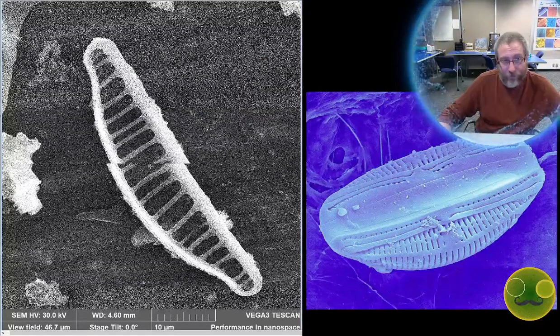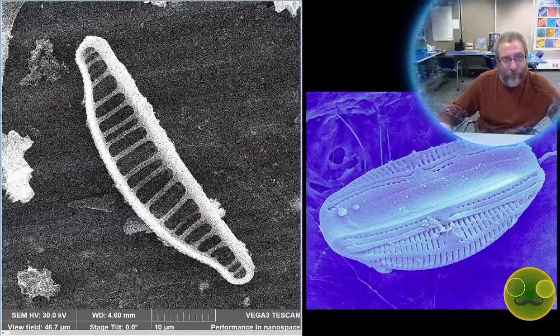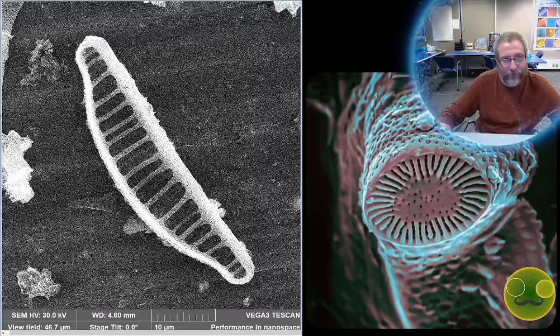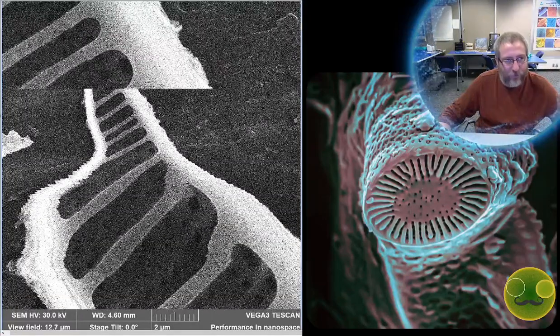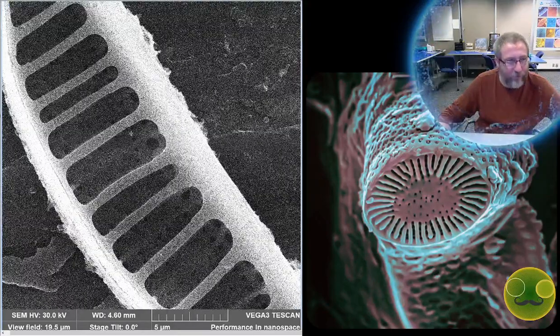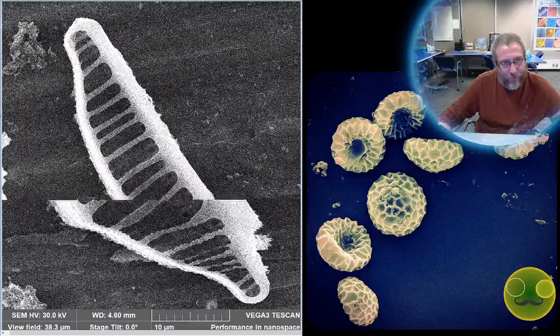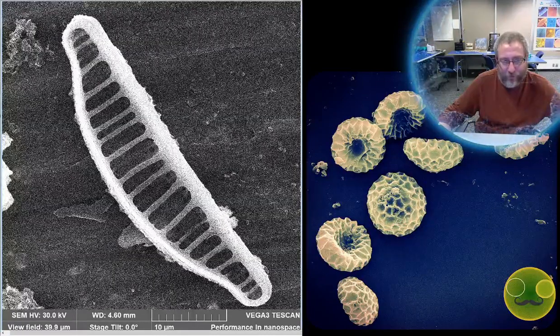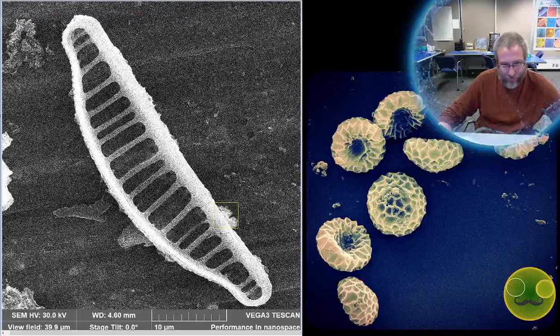This is an Epithemia. Epithemia are characterized by these costae that go across the entire valve face. And they usually have a raphe that comes up onto the valve face, and it's like a slot-like structure that comes up onto the valve face here into the middle. And I can see a hint of it. If I zoom in, which we can keep zooming in because we're in a crazy scanning electron microscope, you might be able to see a little bit of it. I think it's right in here. But this is like an ancient relative, or potentially just straight up Epithemia. It looks like it belongs to the adnata type of Epithemia species group.